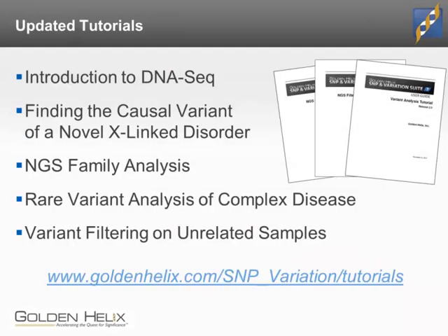The new and updated complete suite of DNA-Seq tutorials include Introduction to DNA-Seq. This is an introductory tutorial covering the basics, including importing data, removing low-quality variants, filtering down to rare non-synonymous variants, and variant classifications. This tutorial is relevant to all workflows. We also have a tutorial called Finding the Causal Variant of a Novel X-linked Disorder. This is the companion tutorial to the October webcast on the analysis to replicate the results found by Dr. Golson-Lyon.